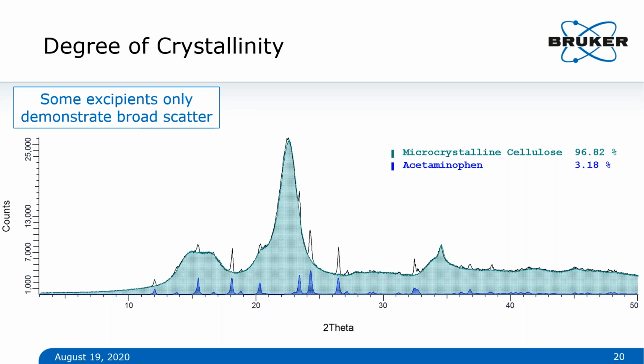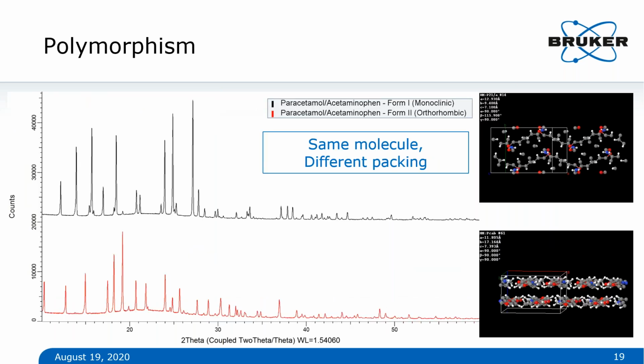So what's remarkable about this is whenever you look at something like cellulose that doesn't have a lot of structure, we refer to this as not as crystalline or amorphous or poorly crystalline. So this is represented by the shaded in area in the teal color and the light green color. Not a lot of very strong diffraction. Right? So previously, up until this point, if we go back one slide, you see very, very nice sharp peaks.